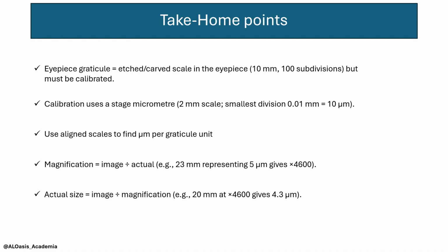Also remember the formula to find magnification, which is image over actual, and be able to rearrange the equation to find actual size, which is image over the magnification.